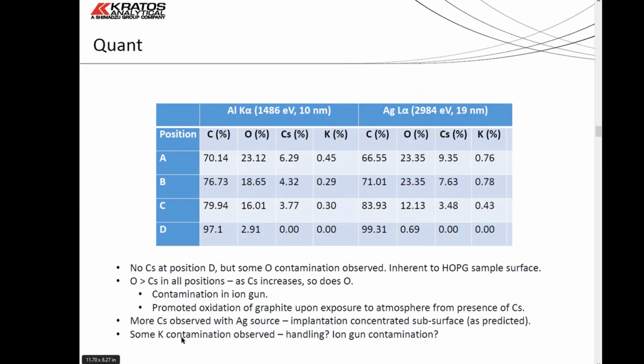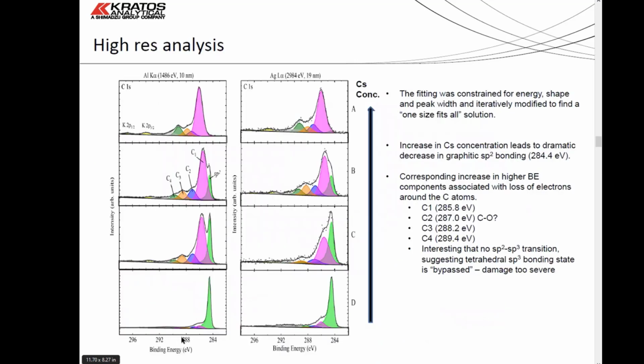The motivation was also to see the distribution of, and the change in, the carbon chemistry. So Alex's real interest was seeing the destruction of the graphite structure, the destruction of the sp2 bonding, and seeing if this caused a buildup in, say, Wigner energy or a change in the lattice arrangement of this material. And obviously that's because graphite rods are used in nuclear reactors to quench the process.